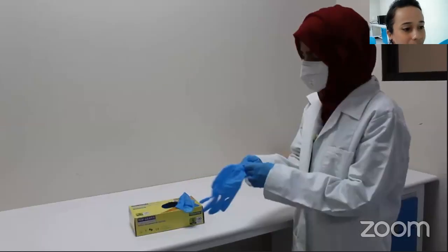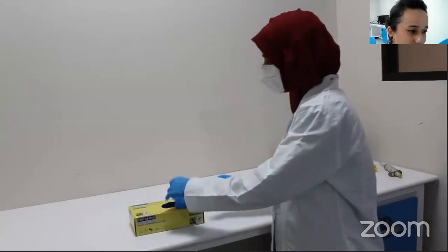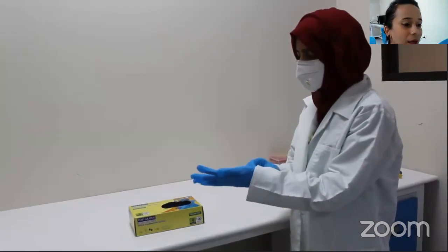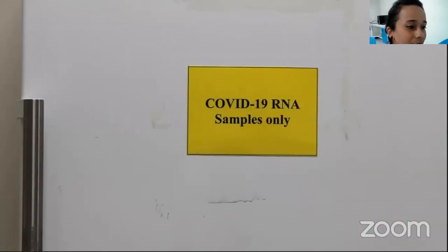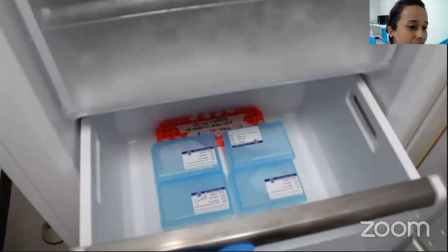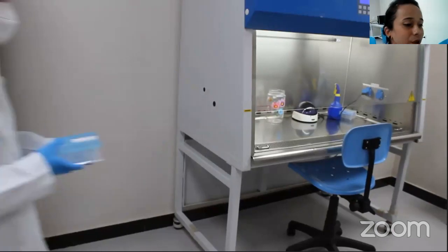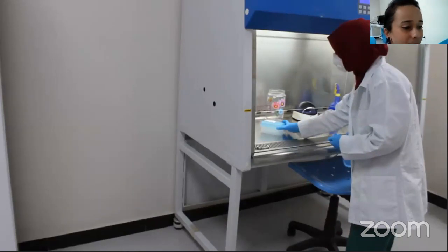So first requirement is you have to wear double gloves, because now you are dealing with viral RNA samples. You have to be careful, and it serves when, if you by any chance get any kind of contamination or sample on your gloves, you can take off your outer pair of gloves in the safety cabinet and wear a fresh one, because it is not recommended to take out your hands wearing contaminated gloves. Now they are taking out the RNA from the -20 freezer. If you have some time before using the RNA, like 5, 10, 20 minutes, maybe you can put it in a fridge or a freezer.